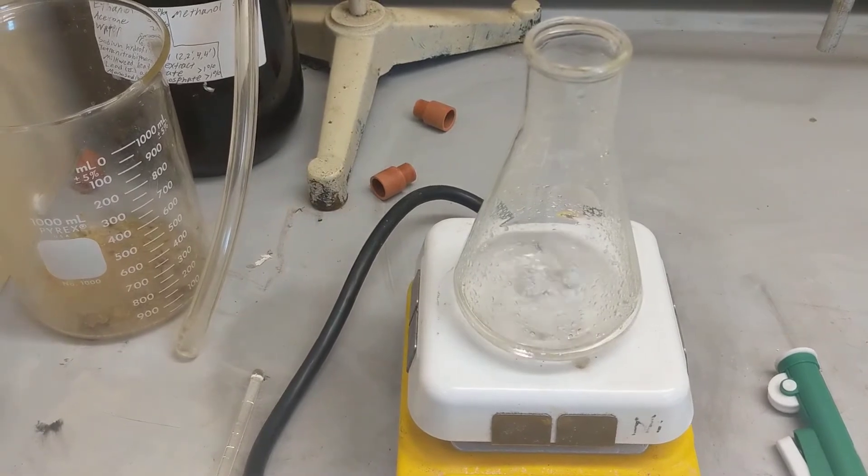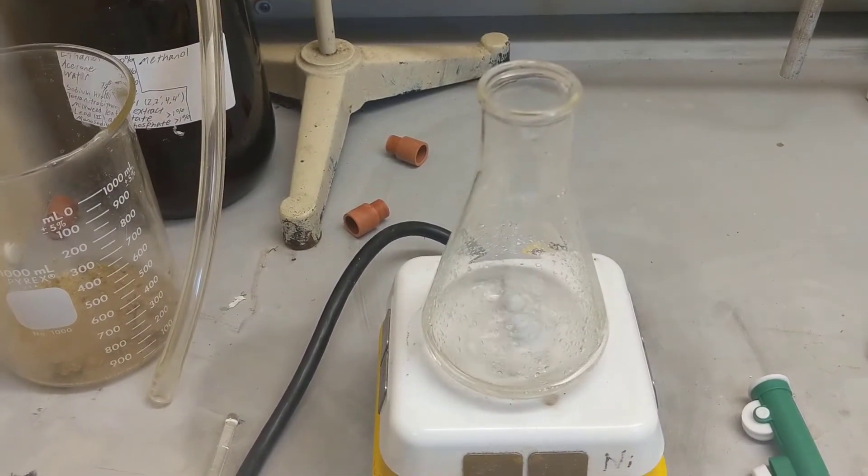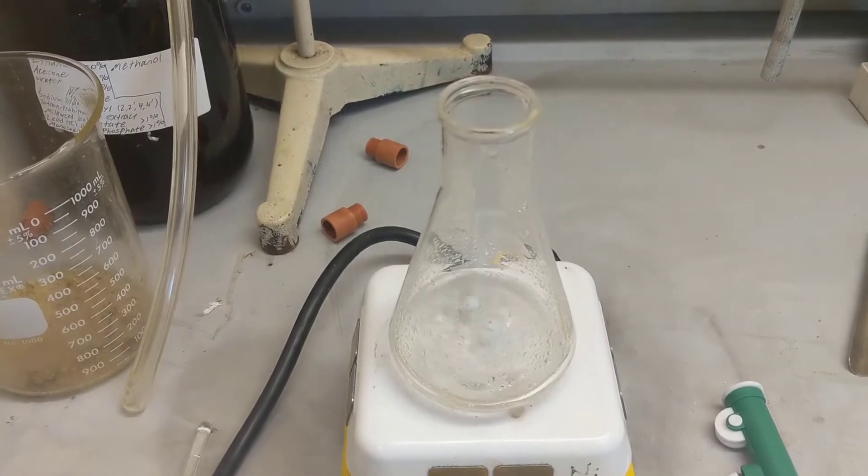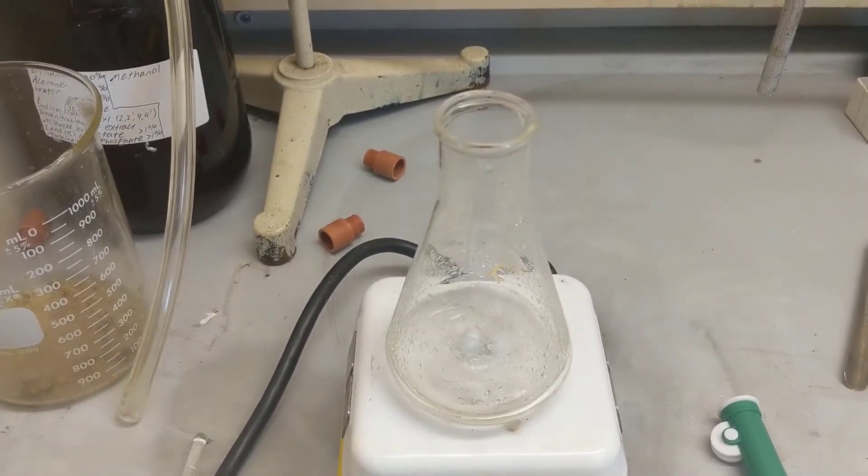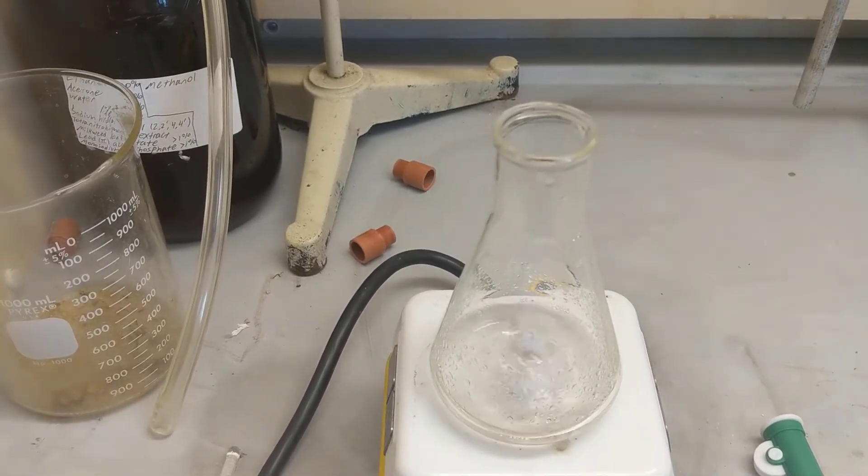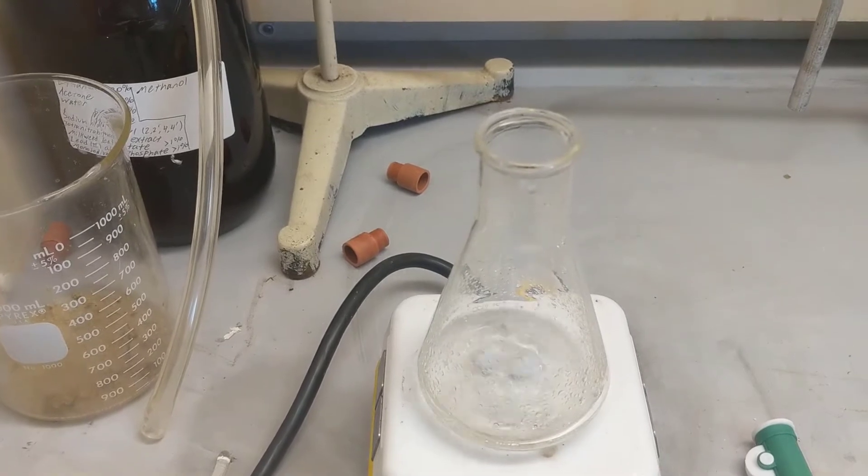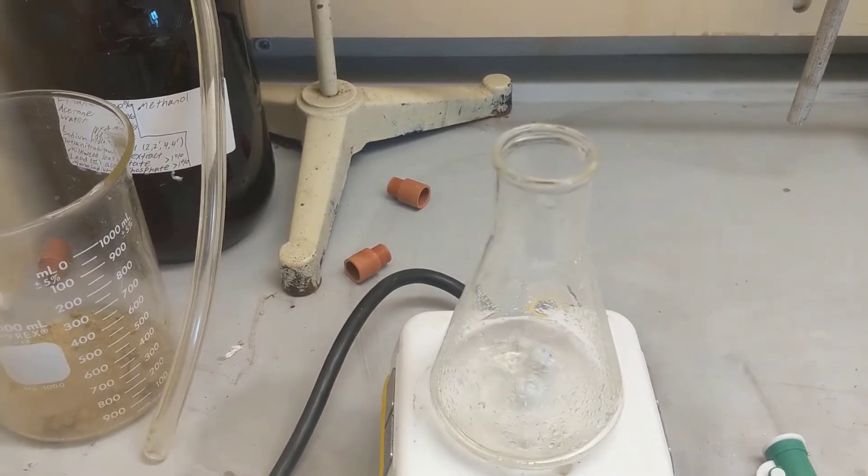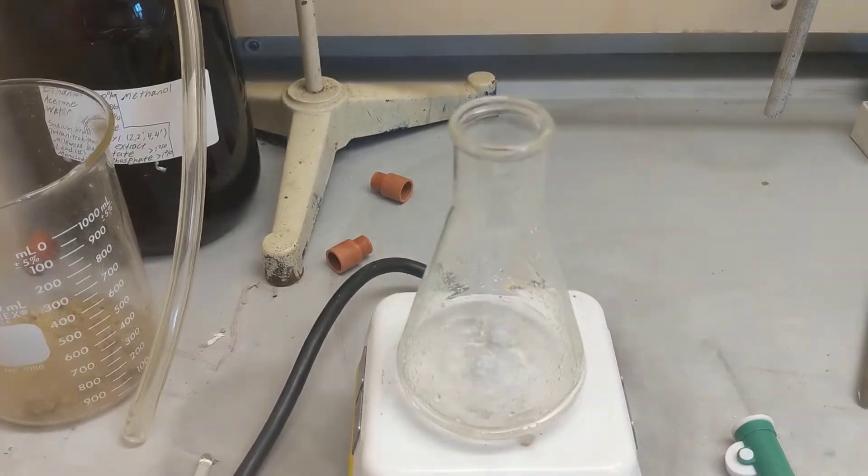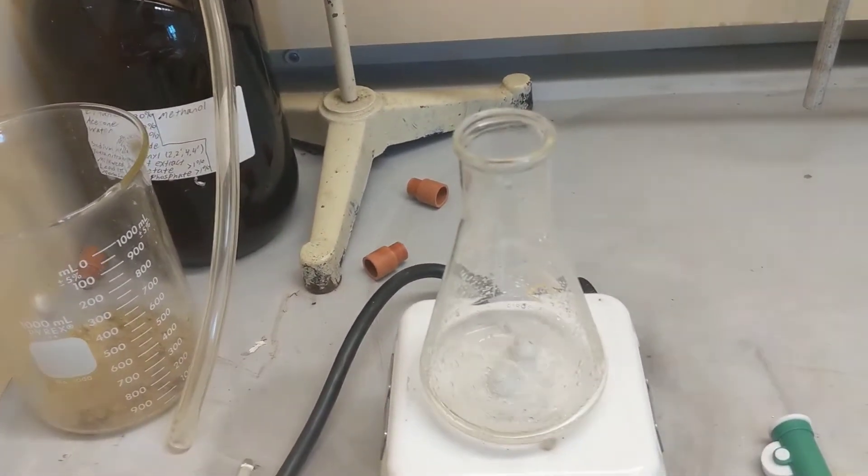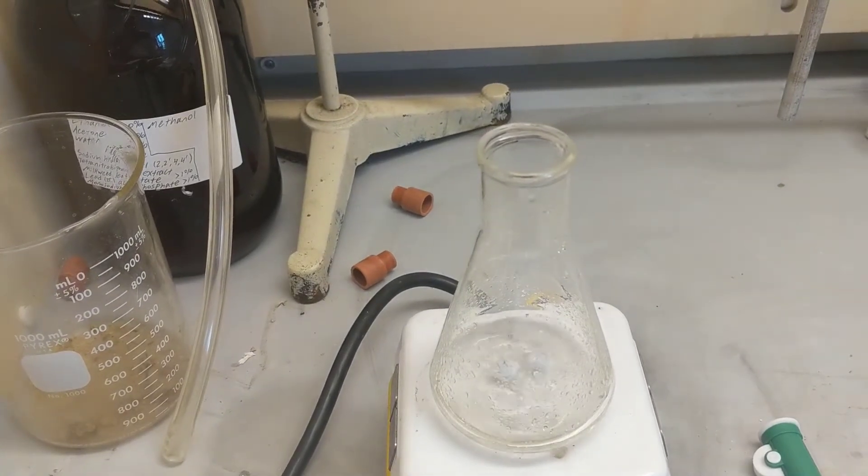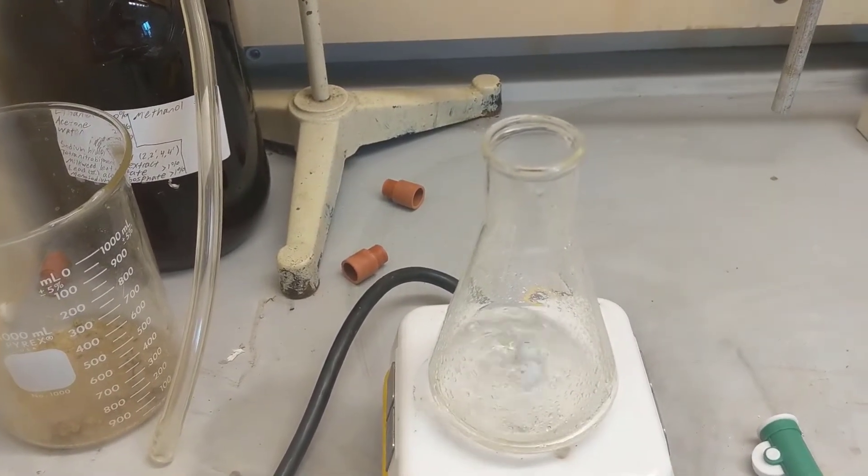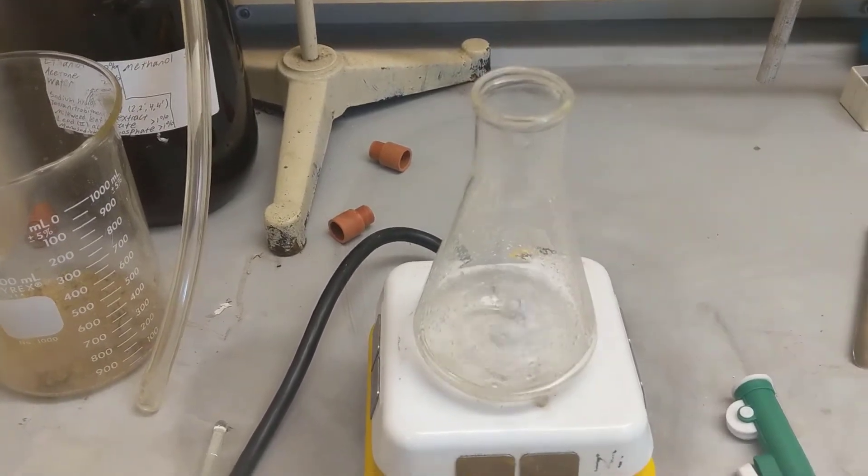You will analyze the product of the three reactions in this experiment by a variety of techniques to determine the relative amount of alkyl chloride and alkyl bromide formed in each reaction. With equimolar concentration of chloride ions and bromide ions reacting with 1-butanol, 2-butanol, and 2-methyl-2-propanol, you will determine which ion is the best nucleophile. In addition, you will determine which of the three substrates this difference is important and whether SN1 or SN2 mechanisms predominate in each case.